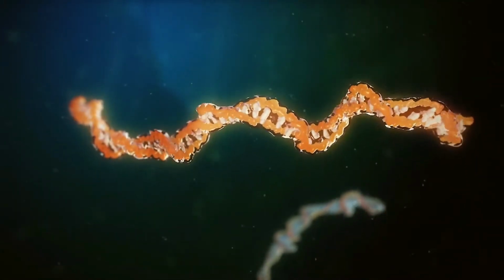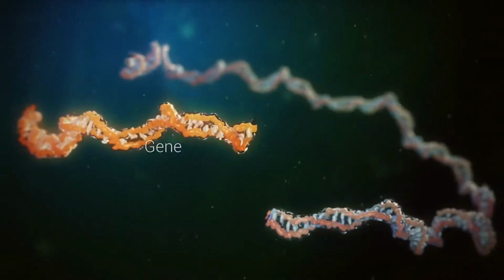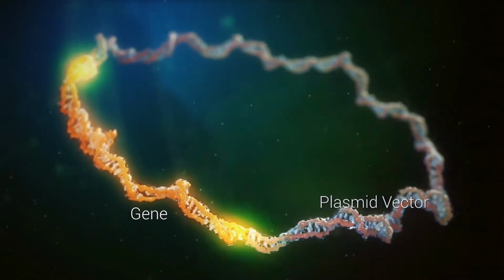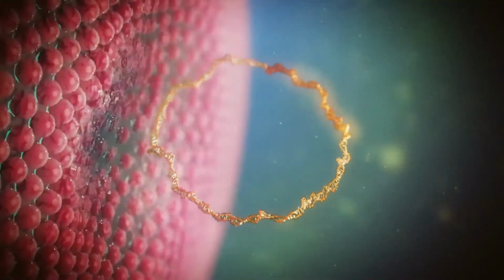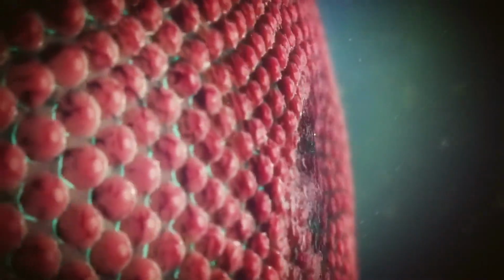Development of a biologic begins by identifying the protein of interest and isolating the gene which codes for it. The gene is then joined to a piece of DNA called a plasmid vector, creating an expression vector used to produce the desired protein.